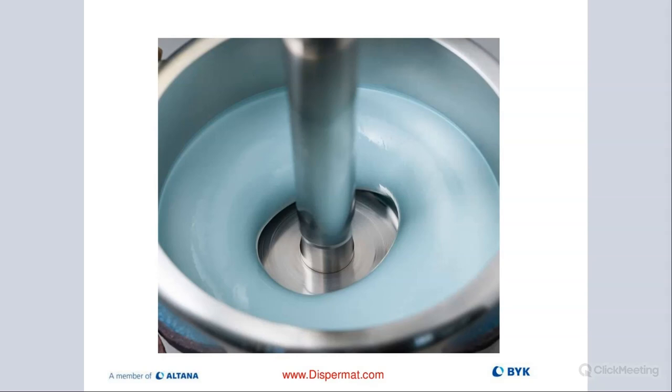So if your viscosity is between 2 to 5,000 centipoise, then you really have no problem seeing a donut. If the viscosity is below that, usually what happens is there is not enough viscosity for a donut to really form. So it doesn't mean you're not pre-dispersing. It just means that you really don't see the donut because the donut will collapse as soon as it tries to form because you don't have enough viscosity.